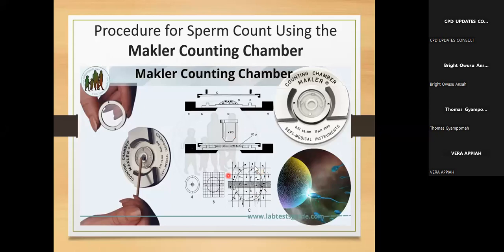and then you are going to see the squares. And I'm saying the squares are 100, 10 this way and 10 that way. And then you are going to take any 10 of them. So we recommend that you can go diagonal like this. Diagonal from top here to down here, you are going to get 10 diagonally, and it's like a fair representation across board. So here, let's say this one here, two, this two, this three, there's nothing here along that line.